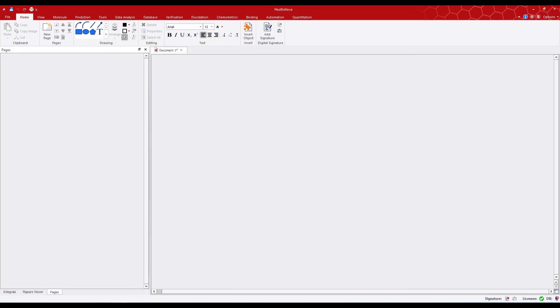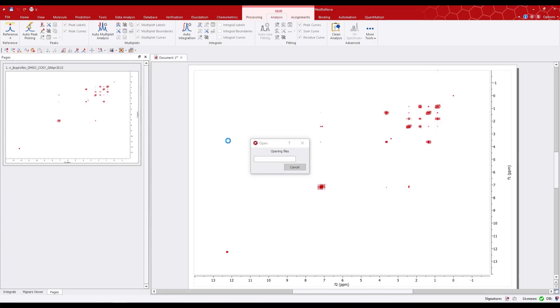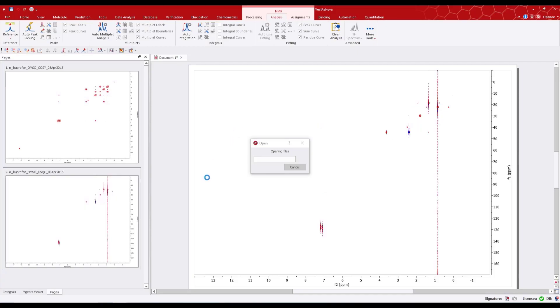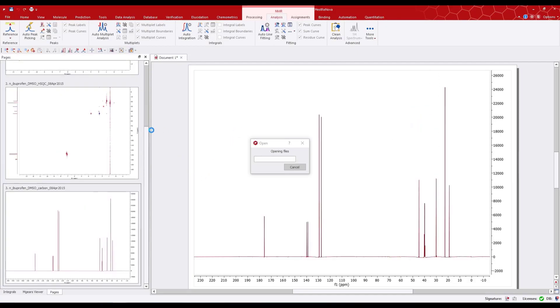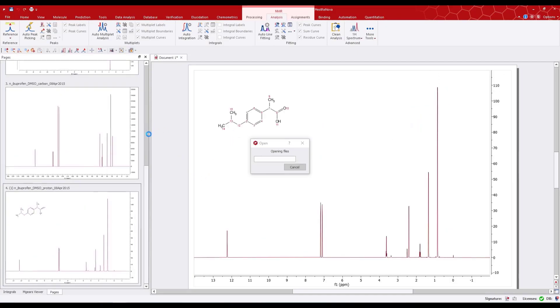Now if we drag and drop the folder, the data will be loaded, but we'll see the structure has now been displayed with the proton spectrum.